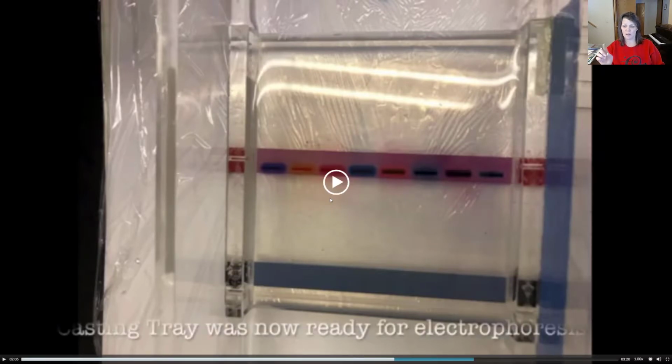It is important that we get all 8 of those wells filled with the ink samples within the first 10 minutes of class. We can do this.